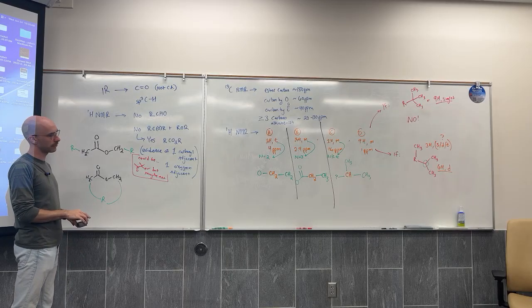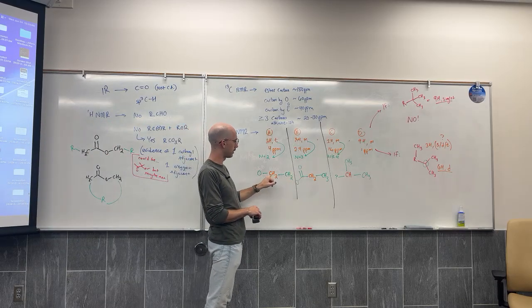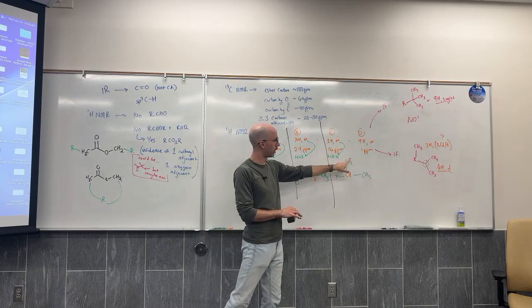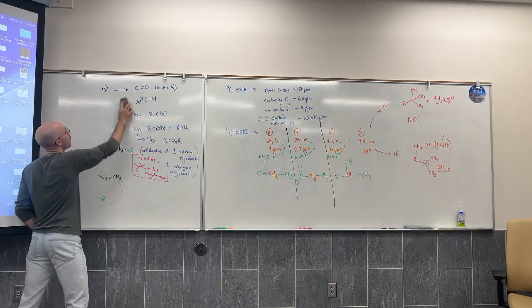And how many carbons have we figured? 1, 2, 3. And I've got the carbonyl carbon. I've got the carbon next to the oxygen. I've got the carbon next to the carbonyl. And then 3 more would be 1, 2, 3. All right, so we start building it from what we have.